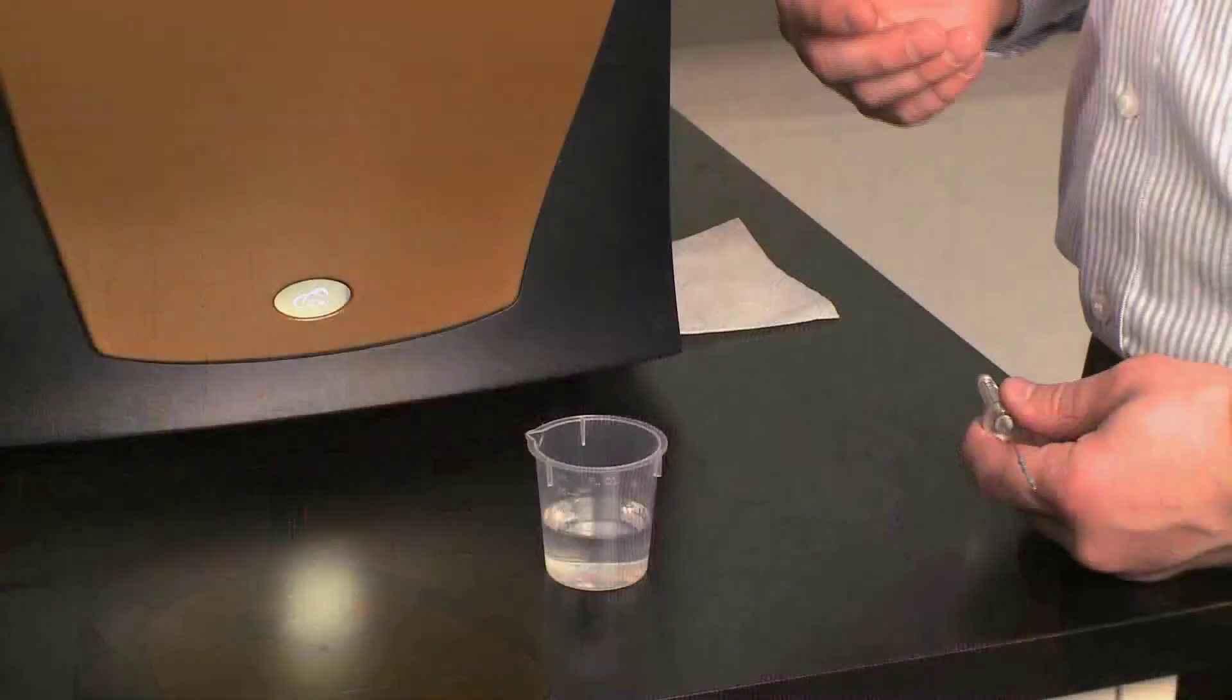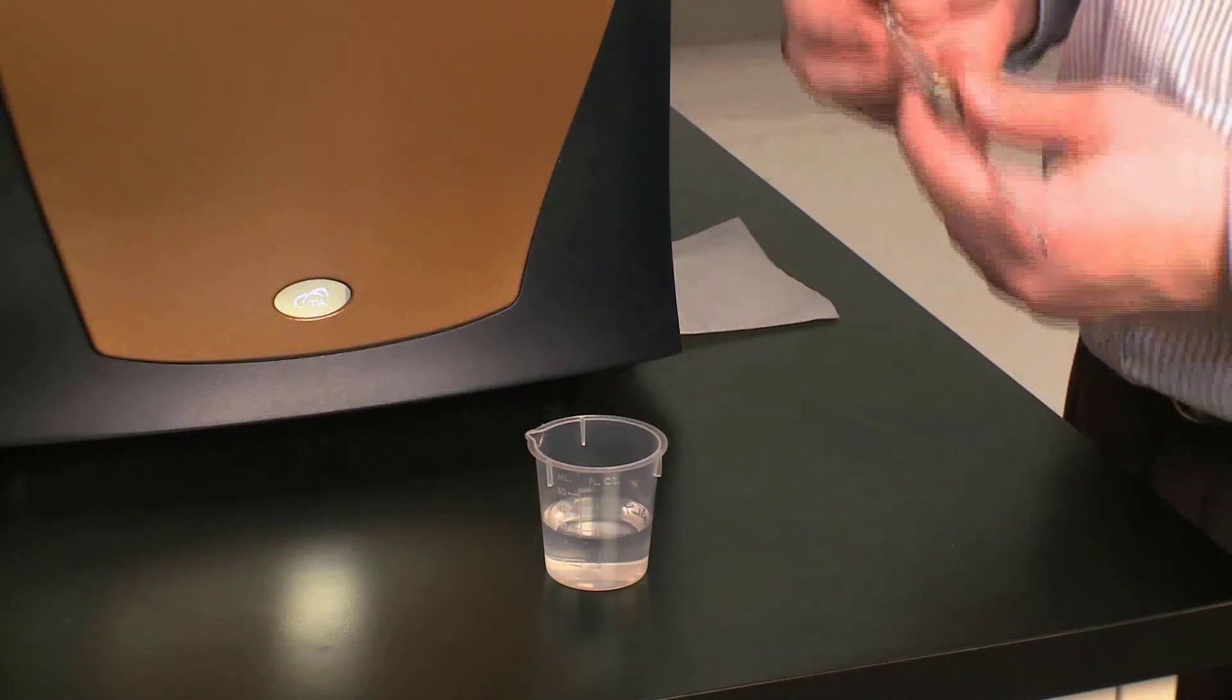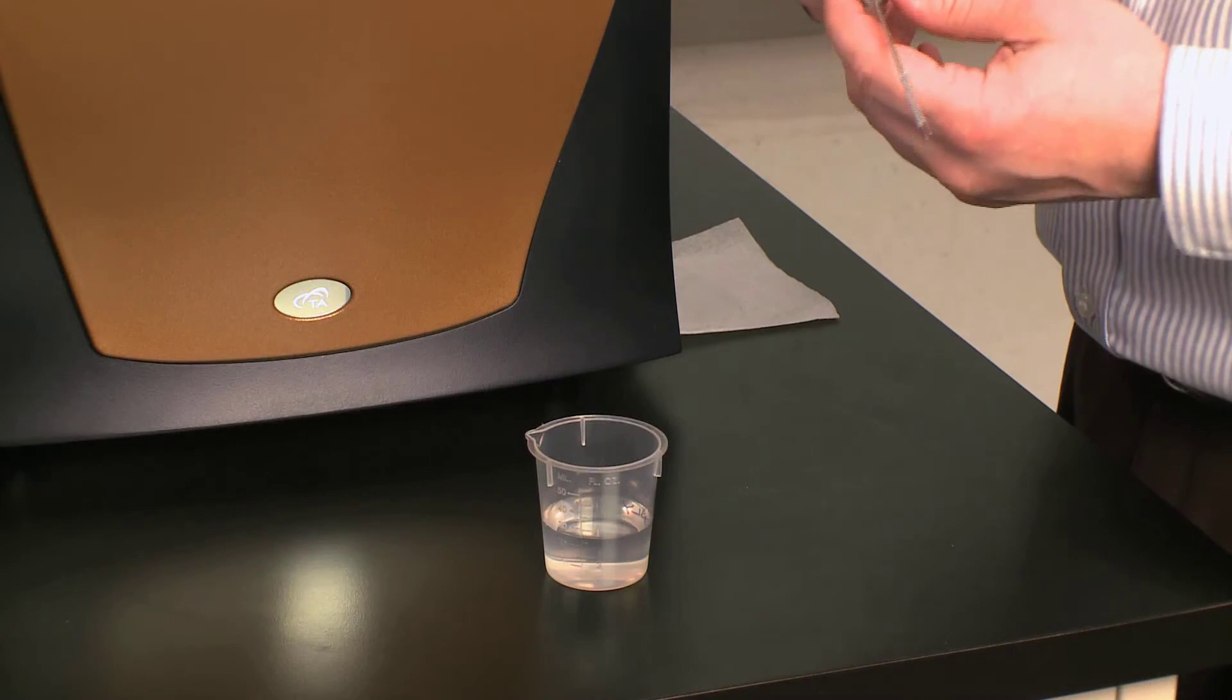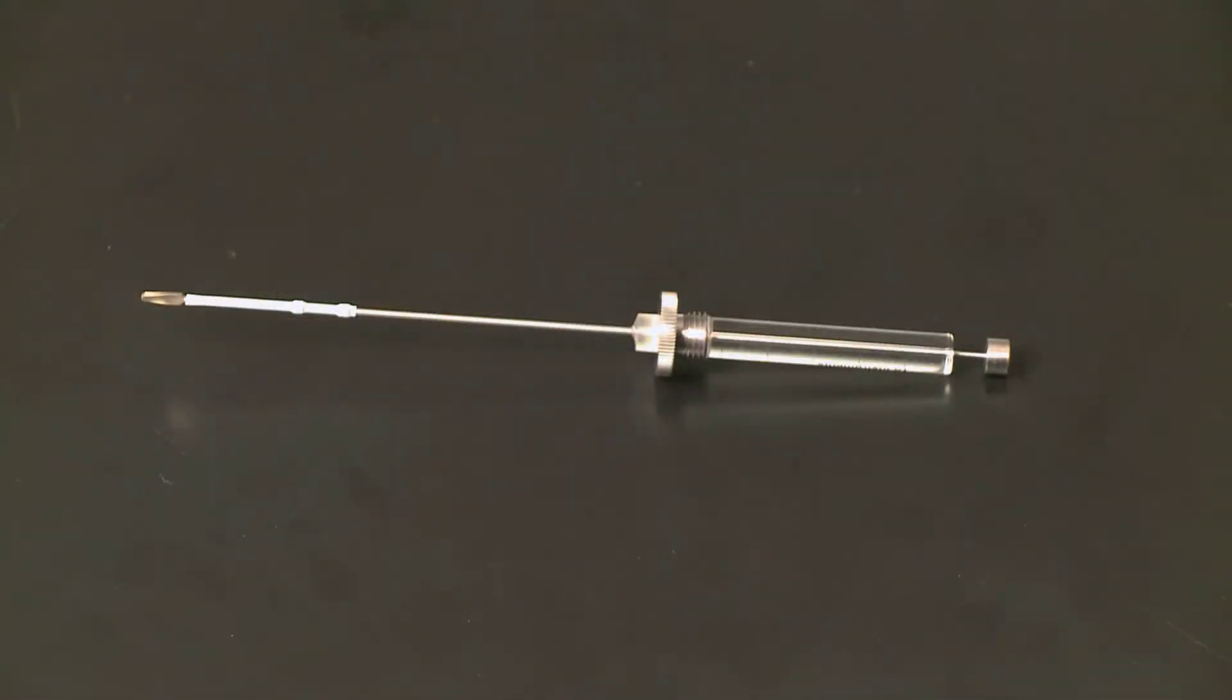In this TA Tech Tip, we're going to be filling the titration syringe for the Nano ITC. Now that you've loaded the cells of the ITC, both the sample and reference sides, you can let them equilibrate while you're filling the titration syringe. I'm using the low volume ITC, so I have a 50 microliter syringe.